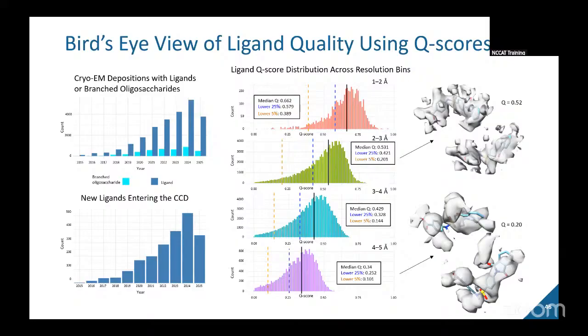So would you say in the one scenario, the atoms are even in empty space, like there's no trace of density there? No trace, but you just have some random noise density, or something that's waters or whatever, and people would put a ligand into it. That definitely happens. I've seen that.